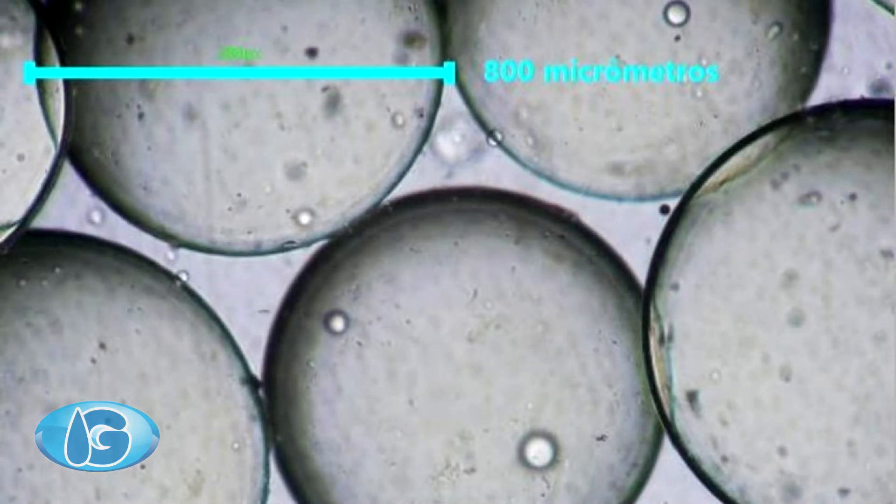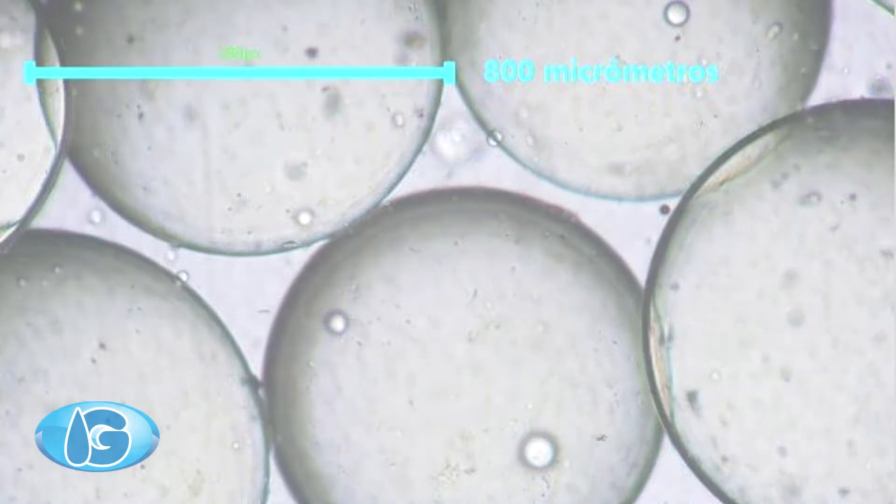Recently, another brands have entered the market. This particular one is a different kind because it has no yellow color or amber color and diameter is larger, something about 800 micrometers. It does not mean this kind of resin is worse or better, but you have made tests and try to use different kind of resins. In the end, you choose the better one. Coincidence or not, this kind of resin is cheaper. What do you think?